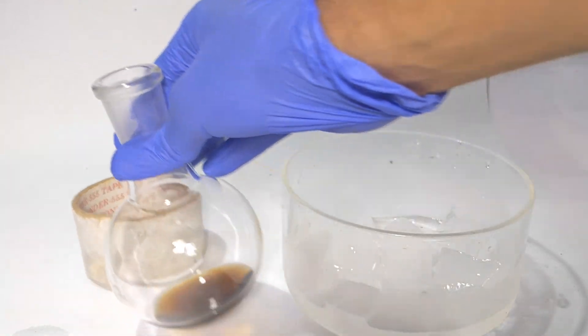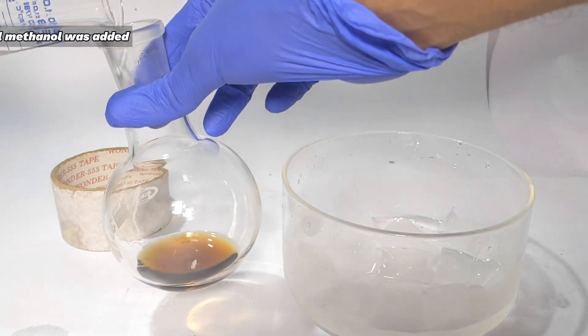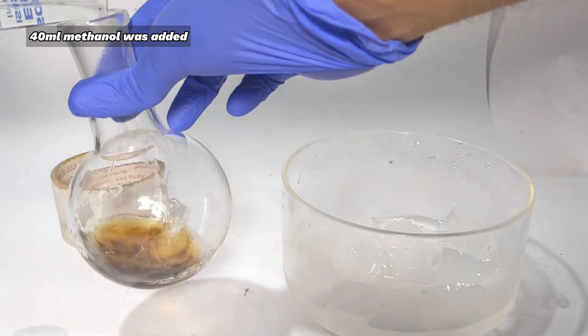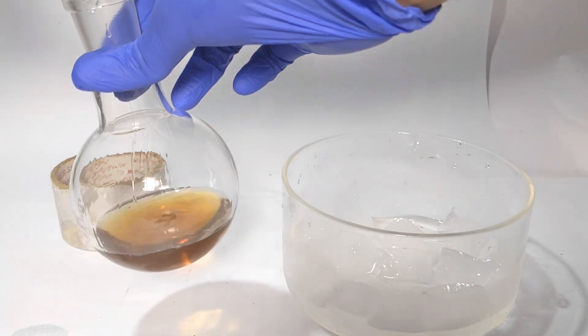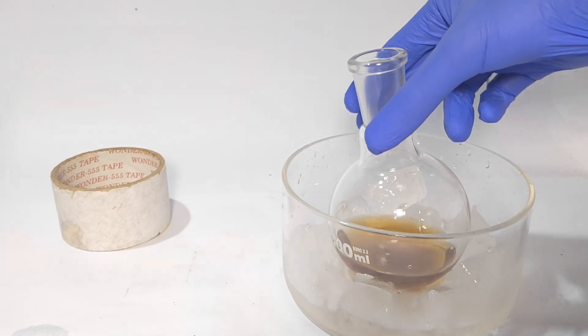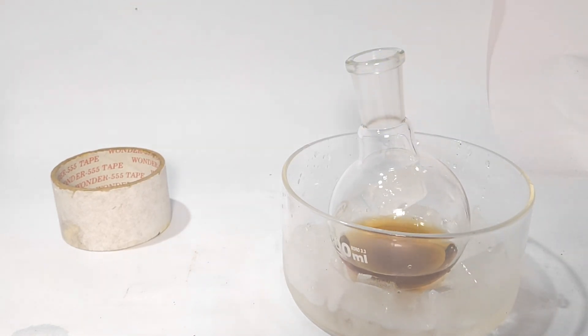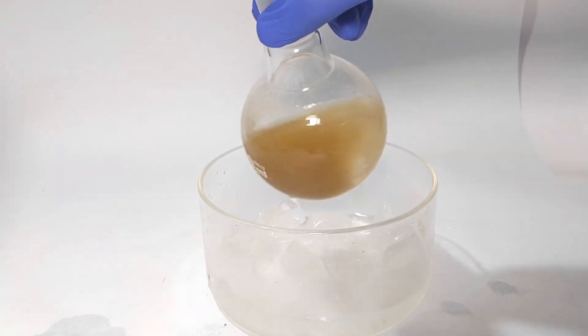Now 40 milliliters of methanol was added to the flask and it was placed in an ice bath with occasional swirling. You can soon see a crystalline precipitate crashing out.